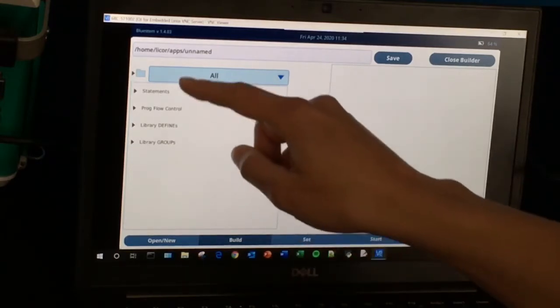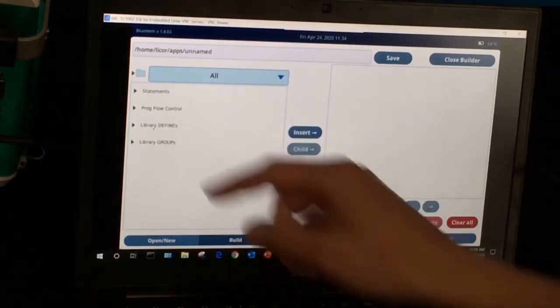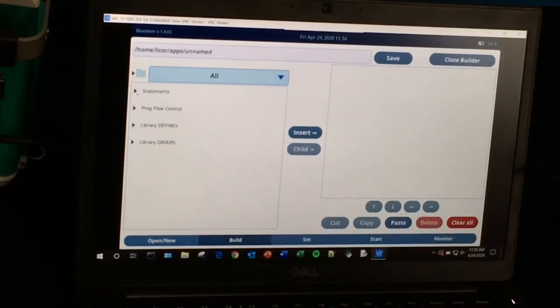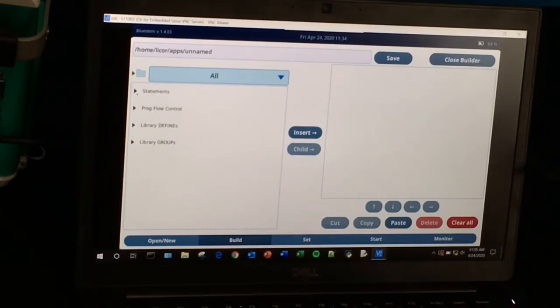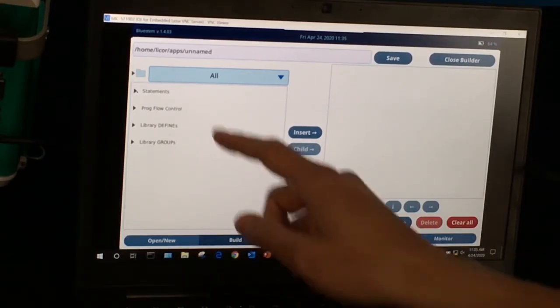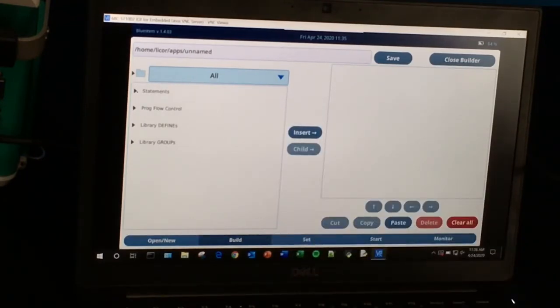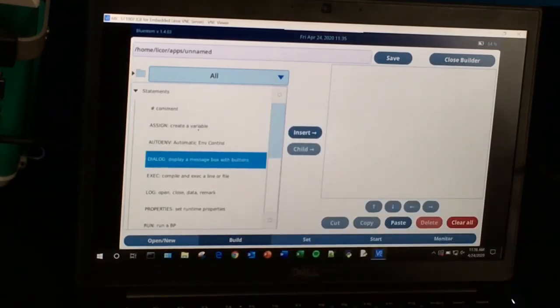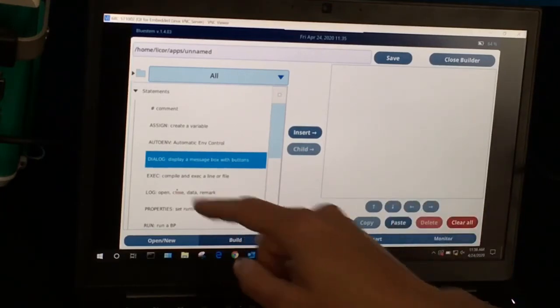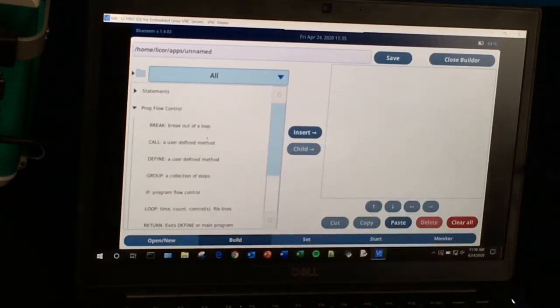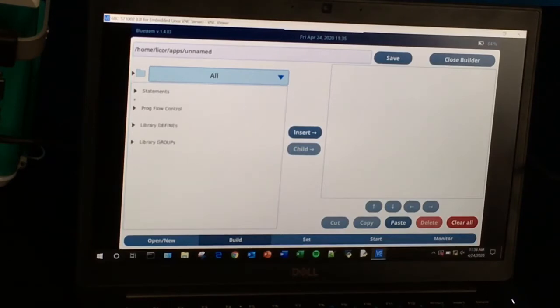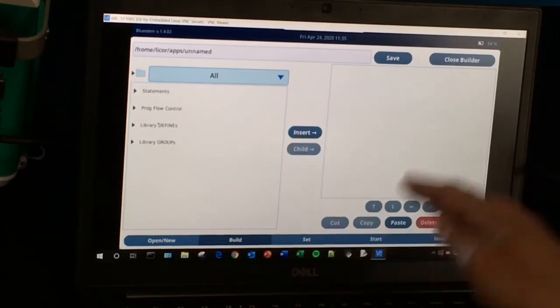These first two groups here are the ones we're going to be using. The other two are libraries, so you might use them later, and if you need more information you can always find it in the background program manual. The statements here relate to something that does something to the instrument — it could be logging a data point, running a background program, etc. The program flow control controls how your program is flowing. We're going to create a little example to show you how to use these different buttons.